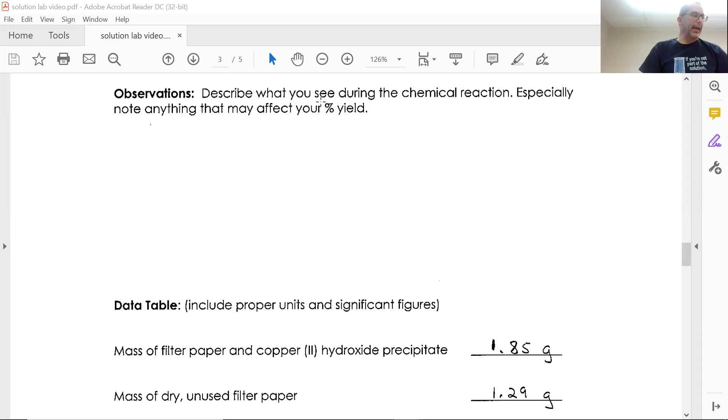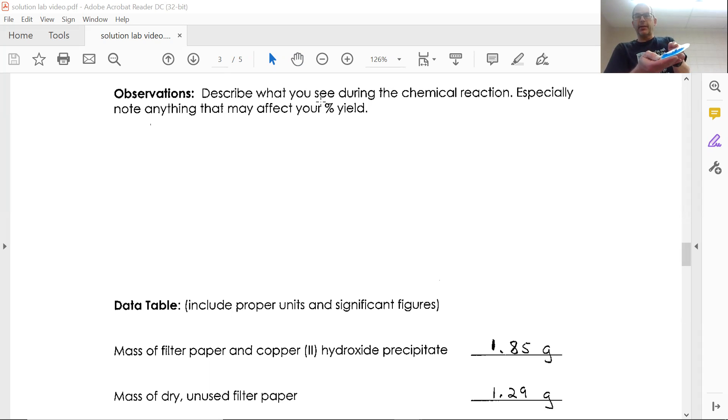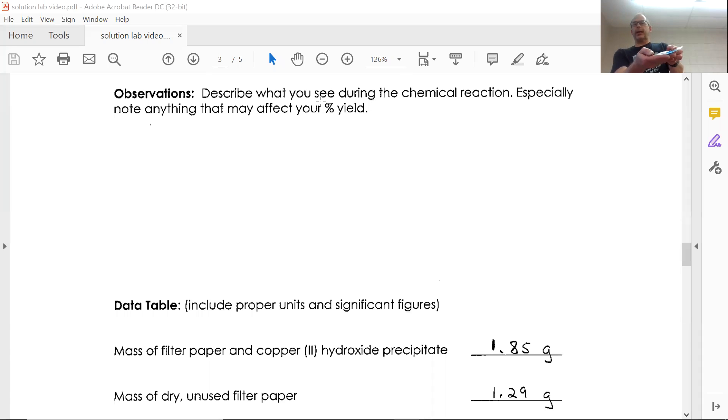What's going to happen is I'm going to weigh this product of copper hydroxide, so you can kind of see it right here. This has only sat out for maybe a couple hours.